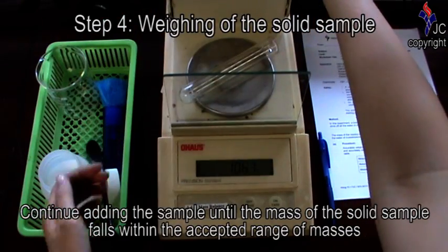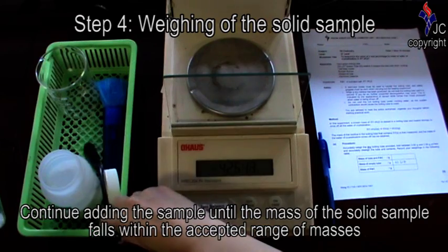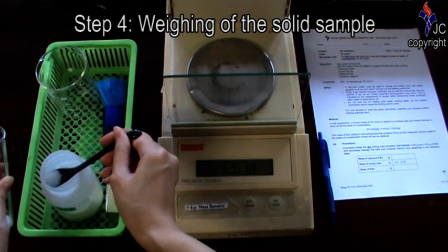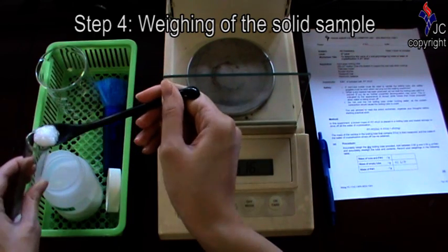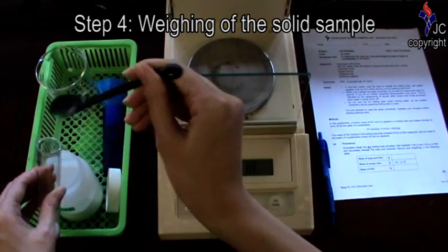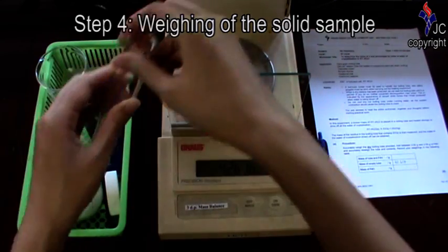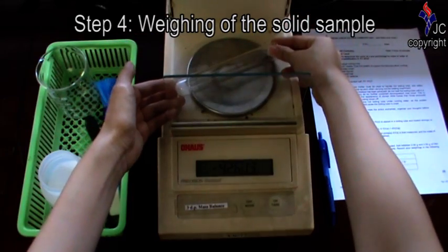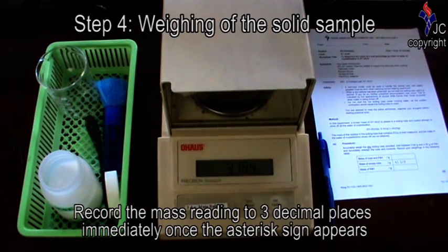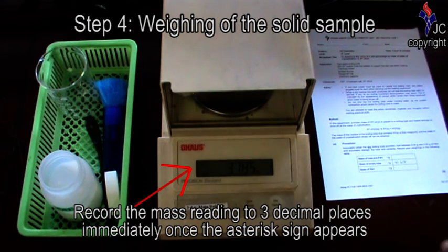Continue adding the sample until the mass of the solid sample falls within the accepted range of masses. Record the mass reading to three decimal places immediately once the asterisk sign appears.